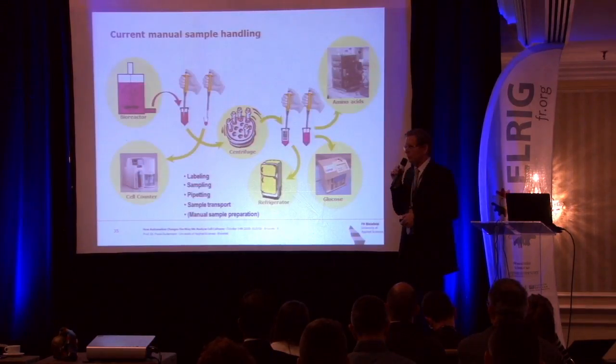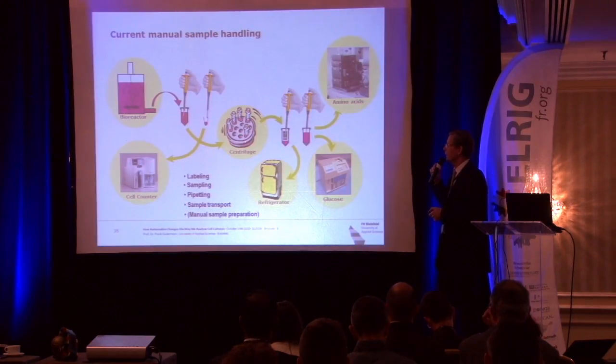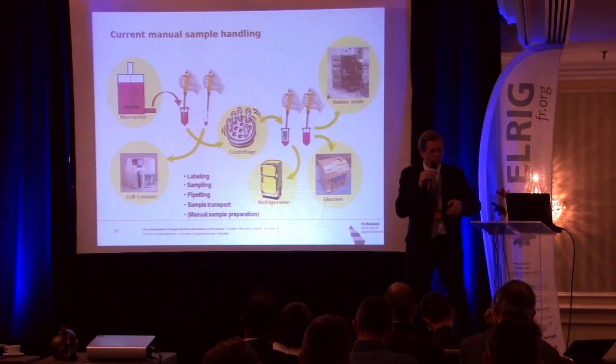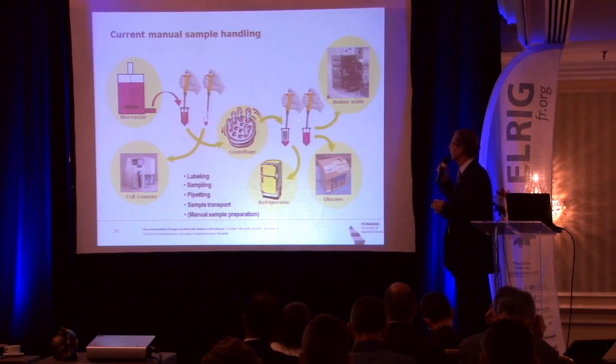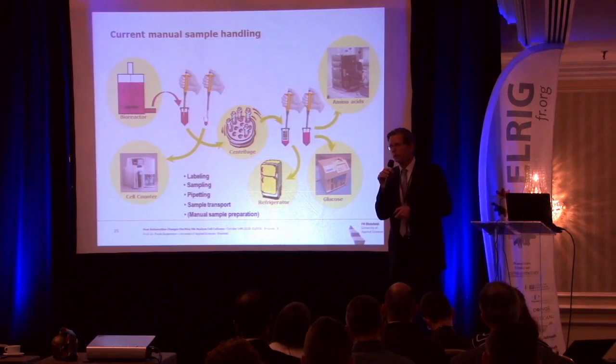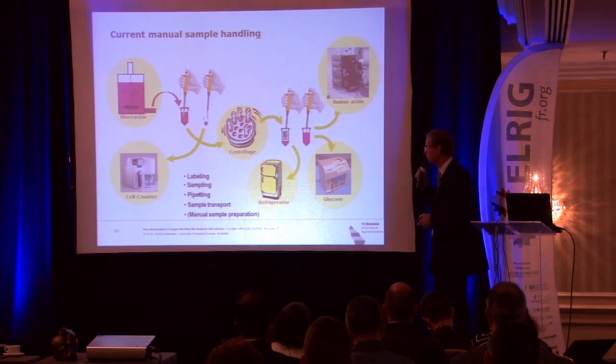And that's, you know, what we try to do, to automate the process of getting a sample out of a bioreactor, then pipetting it into a sample cup that is used for cell counting, then centrifuge the sample, pipette aliquots into barcoded sample tubes to freeze samples for further analysis, you know, for example, antibody concentration, whatever, or for documentation purposes, and to use aliquots for the different analytes using different analyzers. So the robot should move in the lab, avoid, of course, the bioreactors or something that is in its way, and should also avoid human beings.